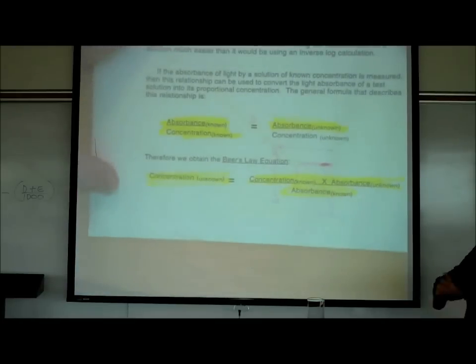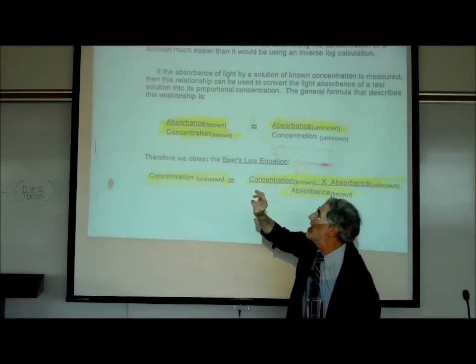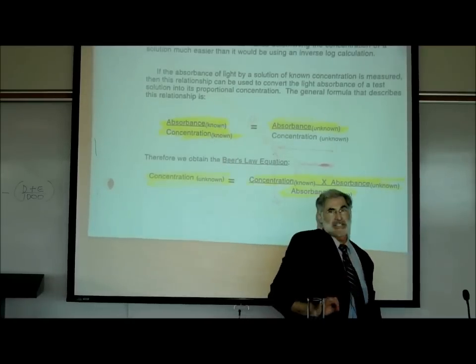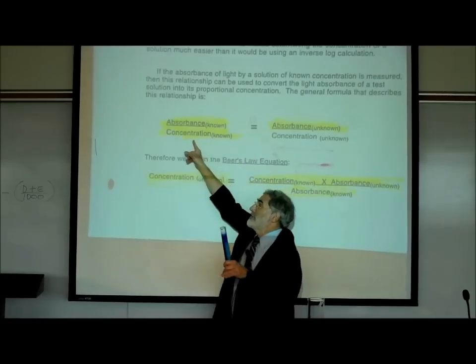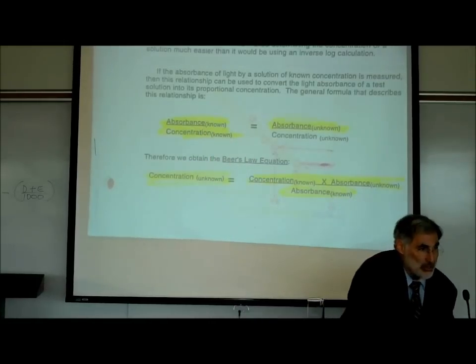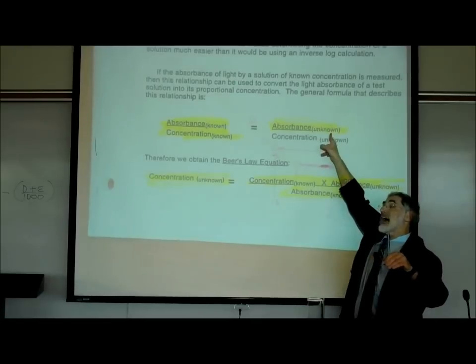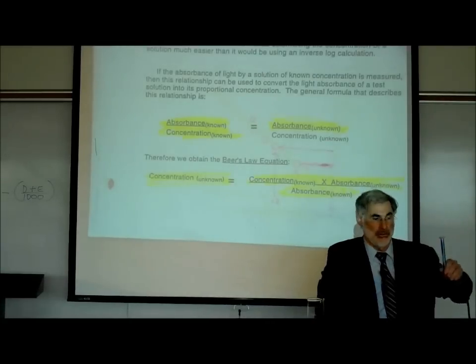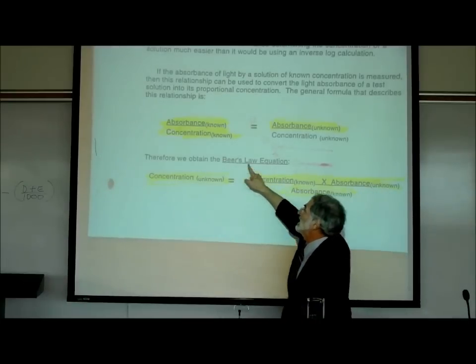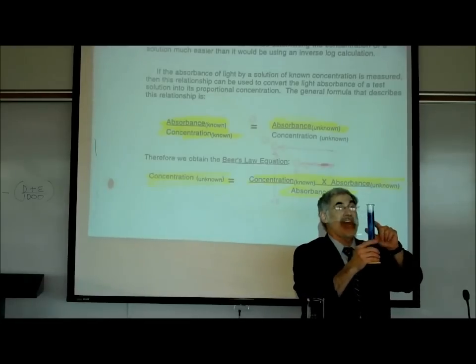All right, the problem with what we were saying here is we were going to determine the concentration of, say, sugar in the blood using one known point. In other words, I had prepared a known sugar solution, and I measured its light absorbance, and then we took the unknown, let's say it's a sample of blood, and we measure its light absorbance for sugar, and then we're going to solve for what the sugar concentration is in this unknown. But we're putting all of our bets on this one known solution, realizing that we never make these totally accurate.